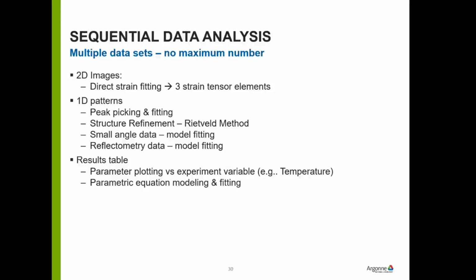You can then fit it with some sort of a function that you think describes the underlying physics, whatever it is that happens. Now, this is distinctly different from so-called parameterized fitting, in which the model includes that mathematical function, to try to describe the variation with a pre-constructed model.